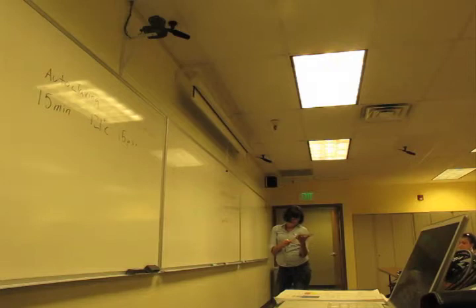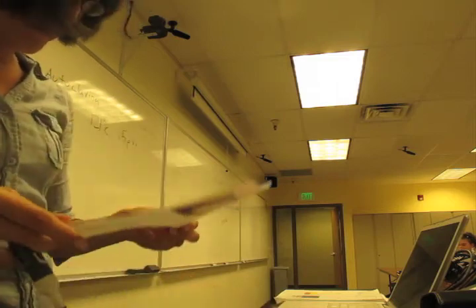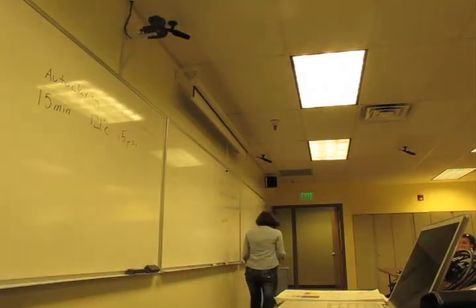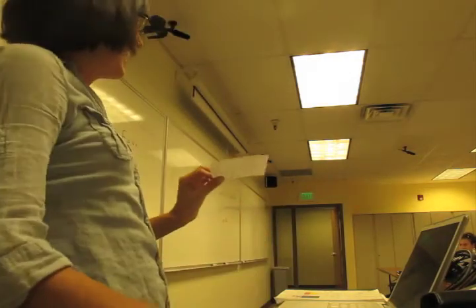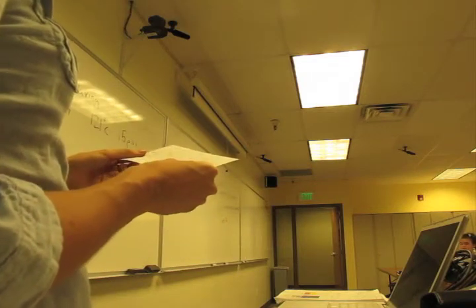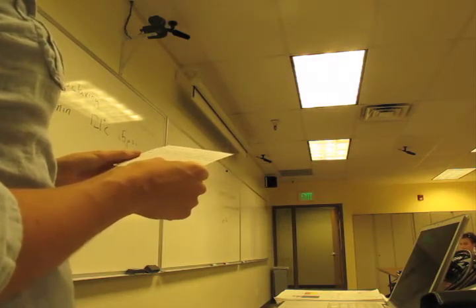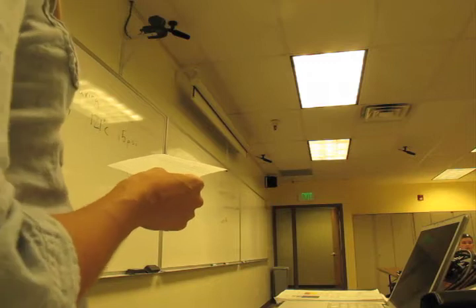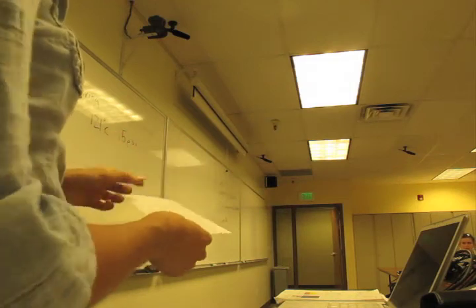Why is it important to do these tests? Does anybody have an answer for that? It's basically a way to differentiate between different bacteria. Why is that important? He's going to ask you clinically how to use this. Why would you care if a bacteria can ferment? It's so you can know your enemy, so you can identify the bacteria. You have to know what it does before you can say, okay, this is how we kill it.